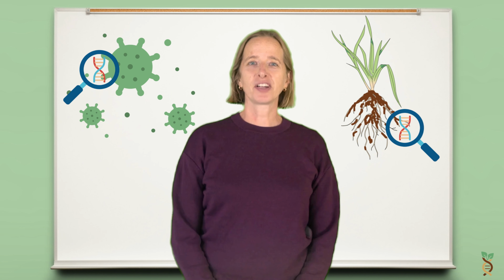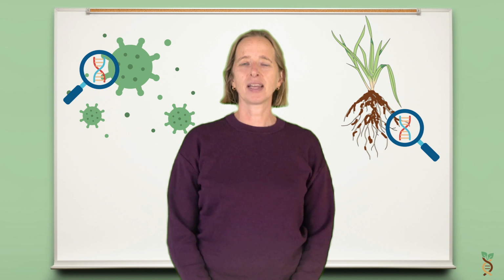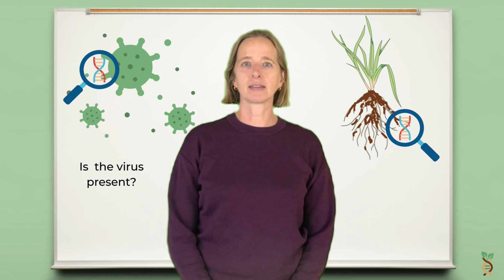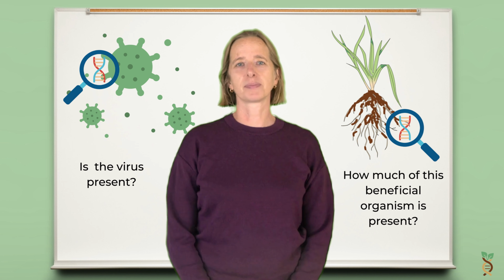But qPCR is not just useful for detecting pathogens and finding diseases. In our research, we use it to look at the beneficial microorganisms living in plant roots. Instead of asking, is the virus present, we ask, how much of this beneficial organism is present?